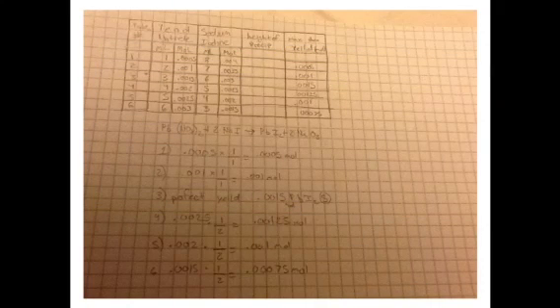So here is our data table. Sorry about that. Here's our data table, and we can see up here, it's kind of hard to see, my bad, the pictures on my iPad aren't great. So we can see the test tubes here, the lead nitrate, the sodium iodide, the height of precipitate, and the max theoretical yield is what we have. You can see my math for the max theoretical yield here.